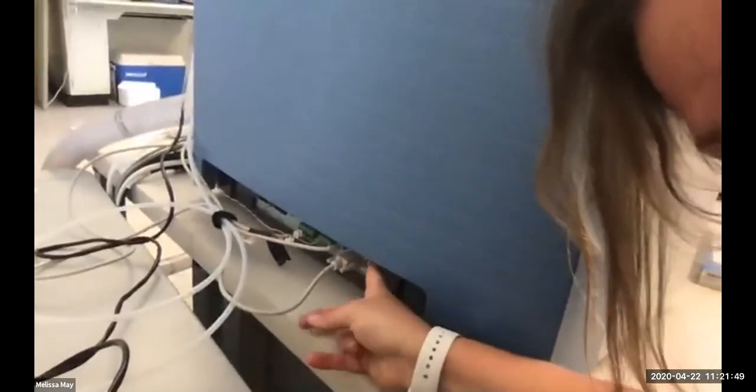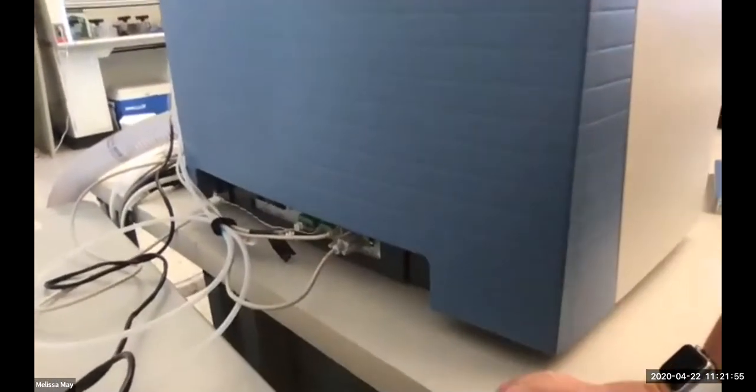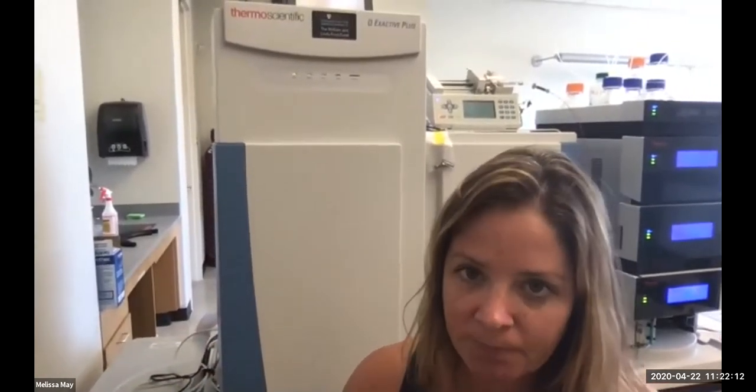There are a series of switches down here. Again, like I said, not a great video. So you have the general power switch and you have an electronics switch. This instrument has the capacity to turn the electronics on and off without actually turning off the instrument. Sometimes there'll be glitches and you can just flip that off and sometimes that'll fix it. Kind of like any sort of technology, right?